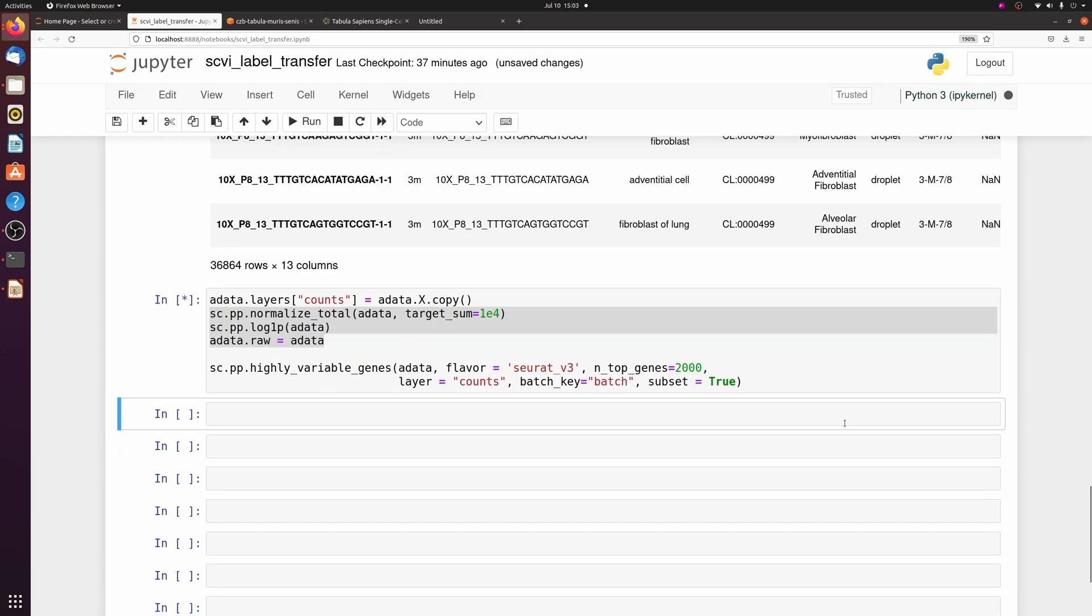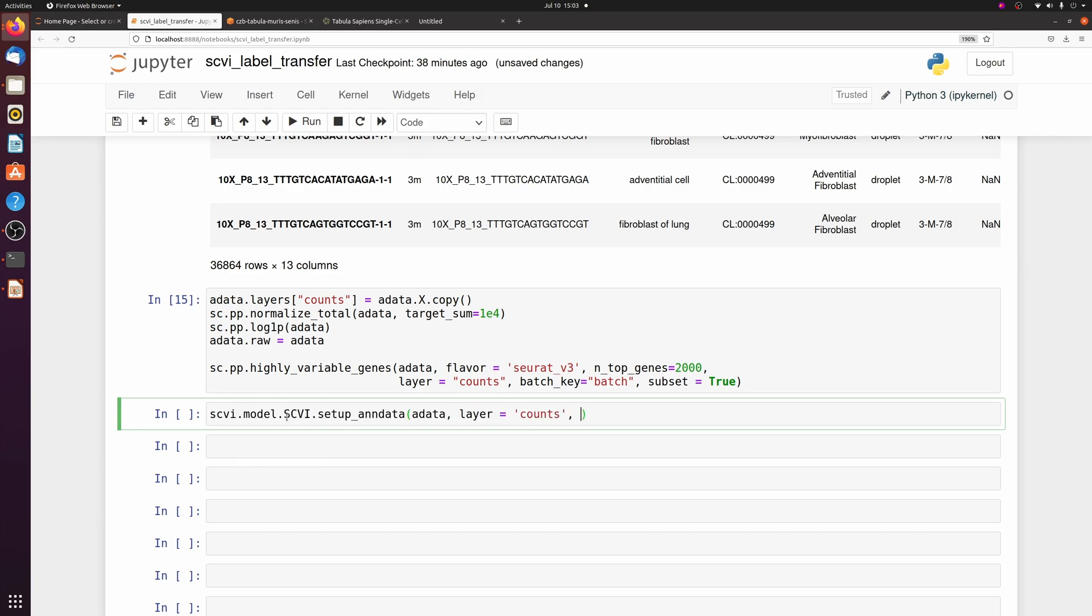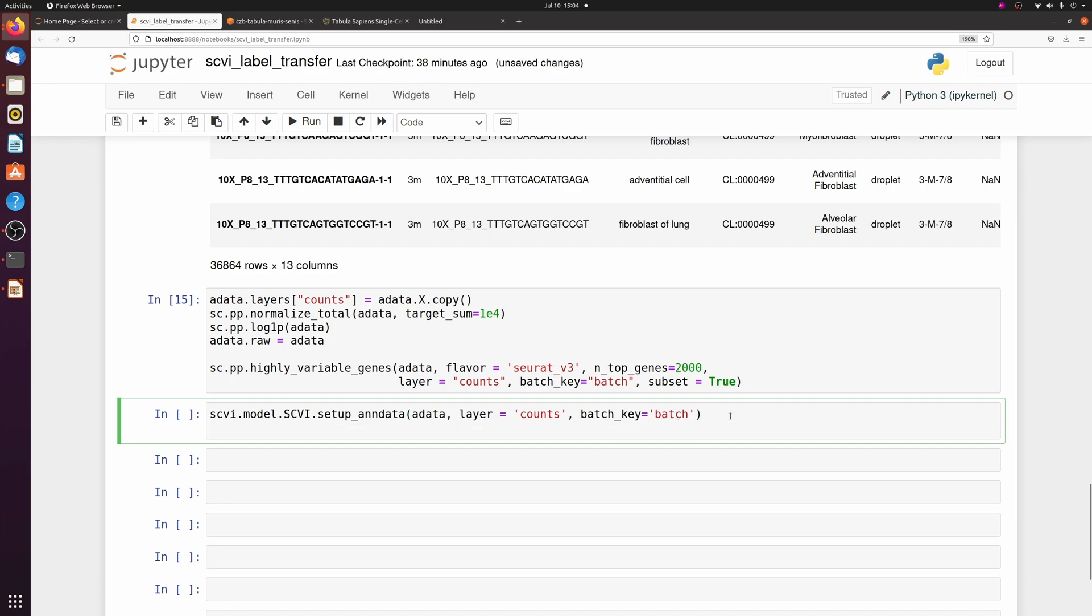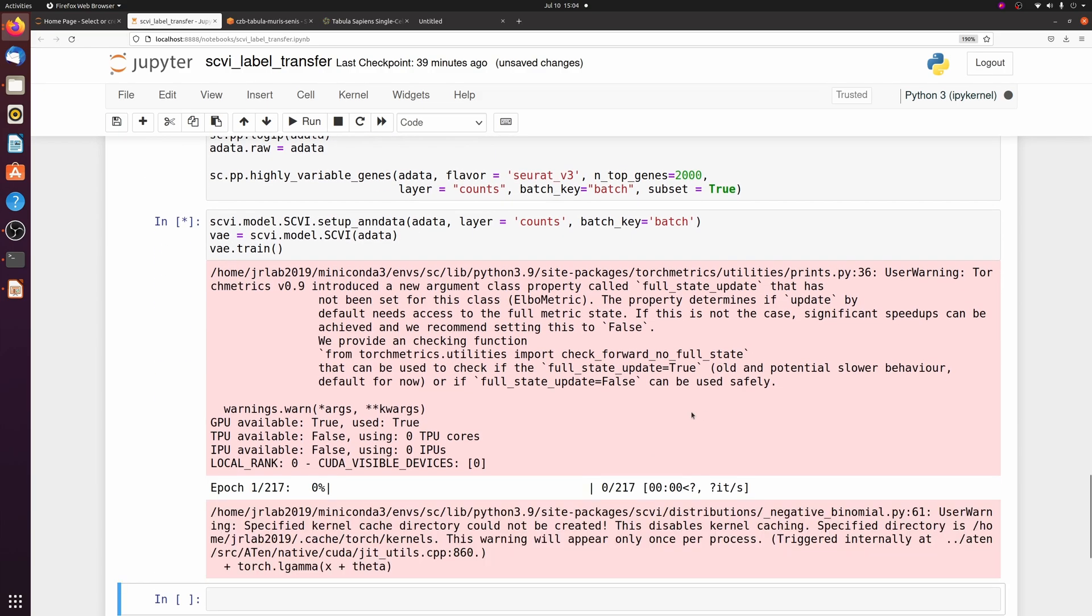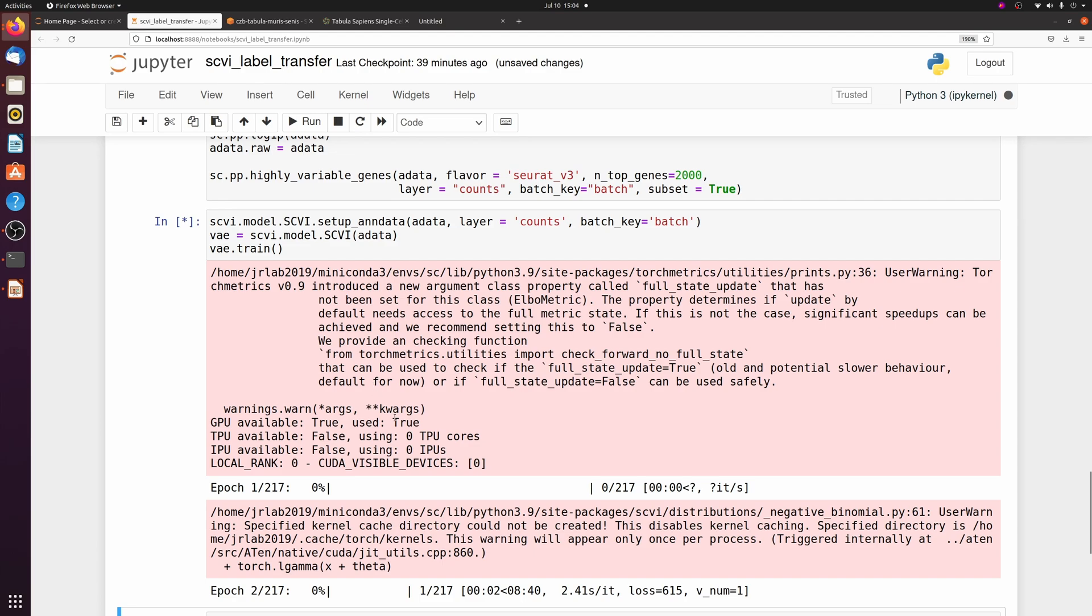Next we just have to set up the scvi model, and again we're passing the batch column as the batch key, so zero or one. Then we're going to train the model and call it vae. This will probably take me about five minutes, but I also have a GPU. If you don't have an NVIDIA GPU it might take longer.